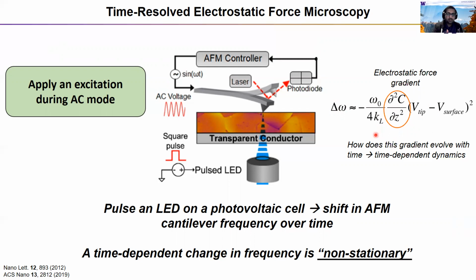And I should pause here to note that the reason that the title of this talk includes non-stationary is that when you have a signal with a time-dependent change in frequency that's not very well defined, that is by definition a non-stationary signal, to use the signal processing field's parlance. So that's what's happening in the AFM cantilever. We apply a pulse, we see a time-dependent change in the resonance frequency.